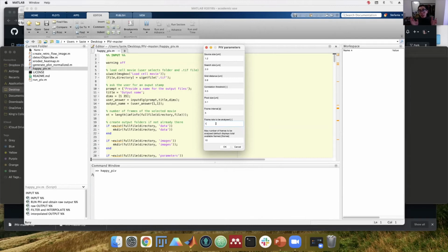If this is not the case, because your temporal resolution was too fast when the acquisition was performed, you can run some tests here in the code by dropping subsequent frames to see if the tracking performs better. You can also pre-process the movie to drop these frames. So both are viable options, but this is sometimes useful in the optimization of the parameters.